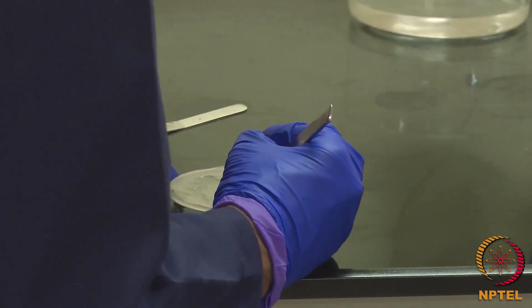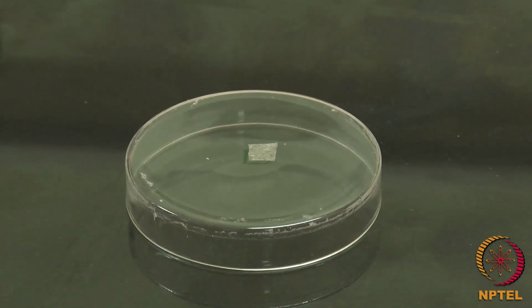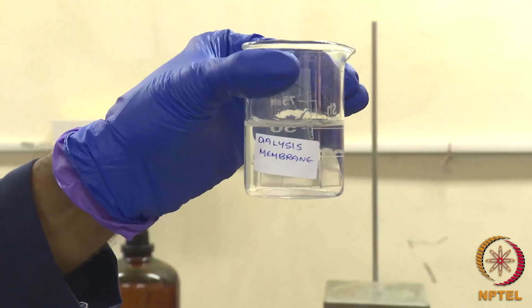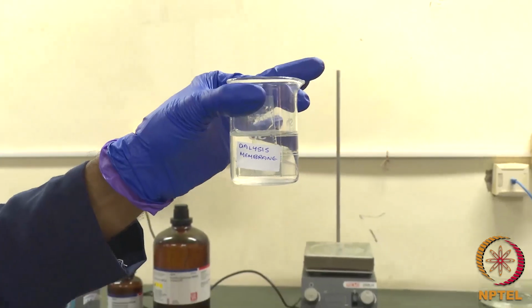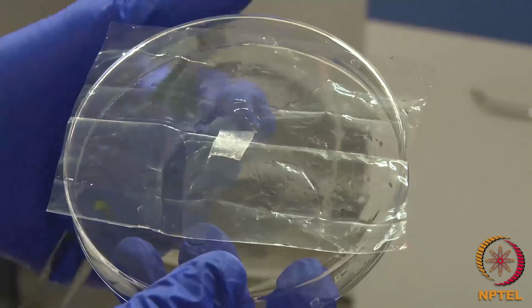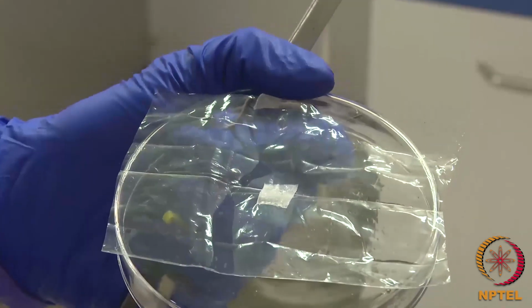1 square centimeter patch was cut and placed in the open-ended tube. One end of the tube is tied with dialysis membrane.